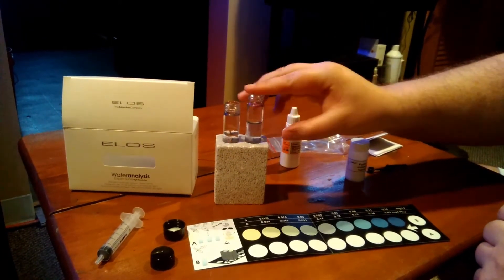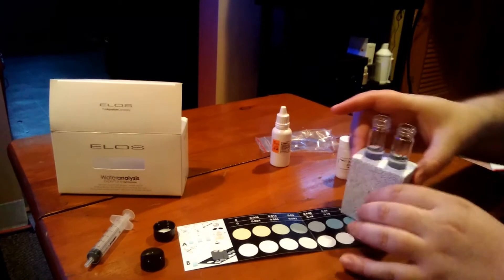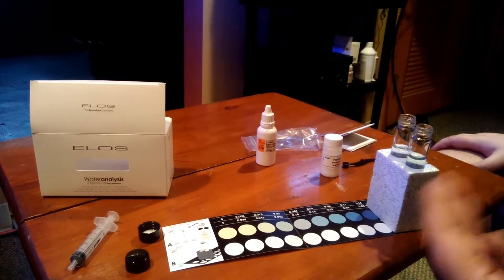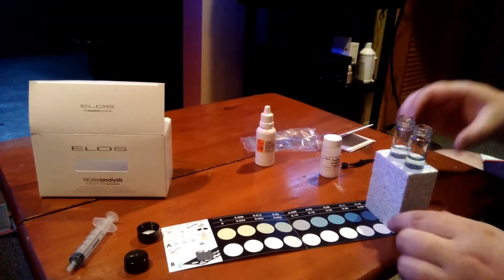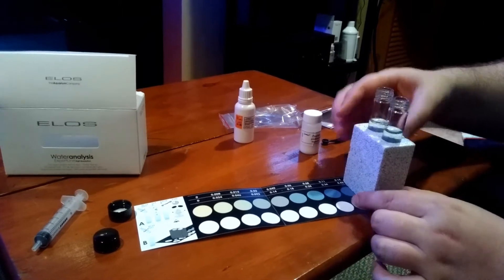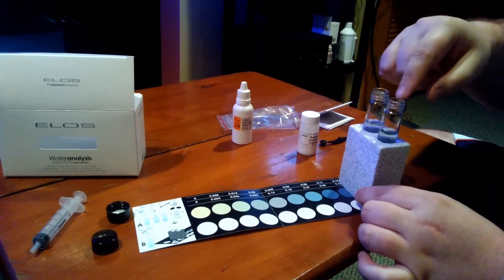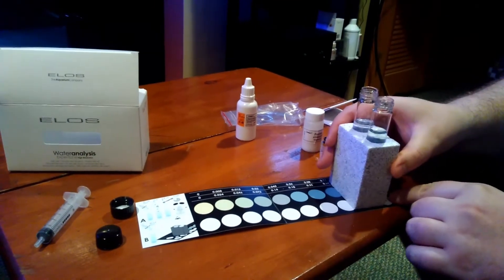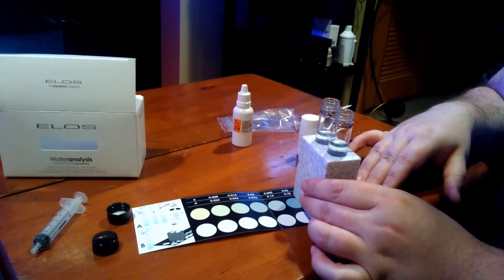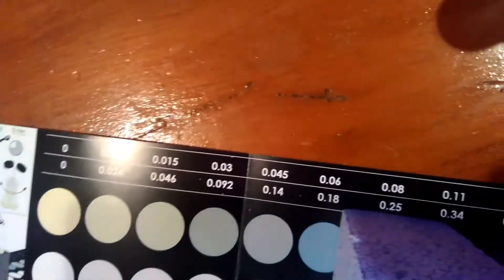You're going to stick this in here. Now you have your water on this side and your reagents on that side. You're going to start it off on the two white. It's going to take three minutes to get your test results, but you can already notice there's a little bit of blue to it. On this side you're going to be seeing the blue through the comparator — that's how you figure out your test results. I imagine mine is around here.